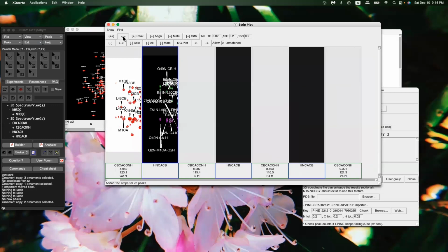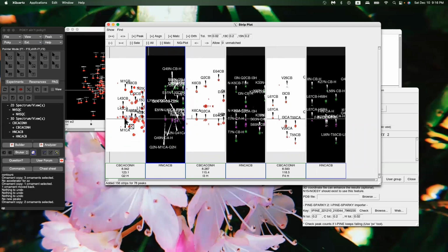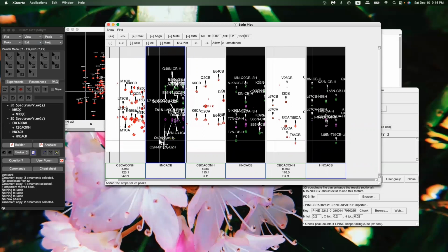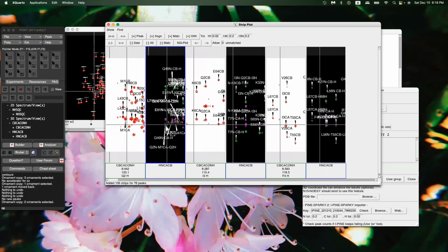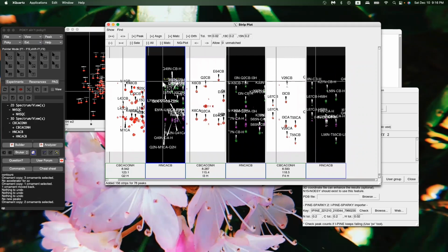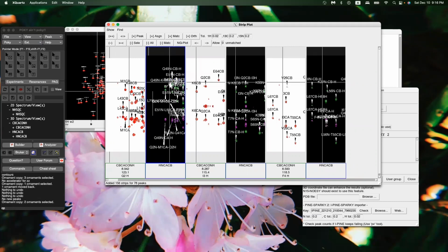We can make it a little wider so you can see it better. Now this label is saying that this peak, your I-1 in the middle, is the M1 CA, and it can be used to find your second residue, your I residue. Then if you look down this line, the other two besides this one is going to be this one right here, which is indeed labeled. It's just a little bit difficult. No, this is not the right label. I believe this is the point.